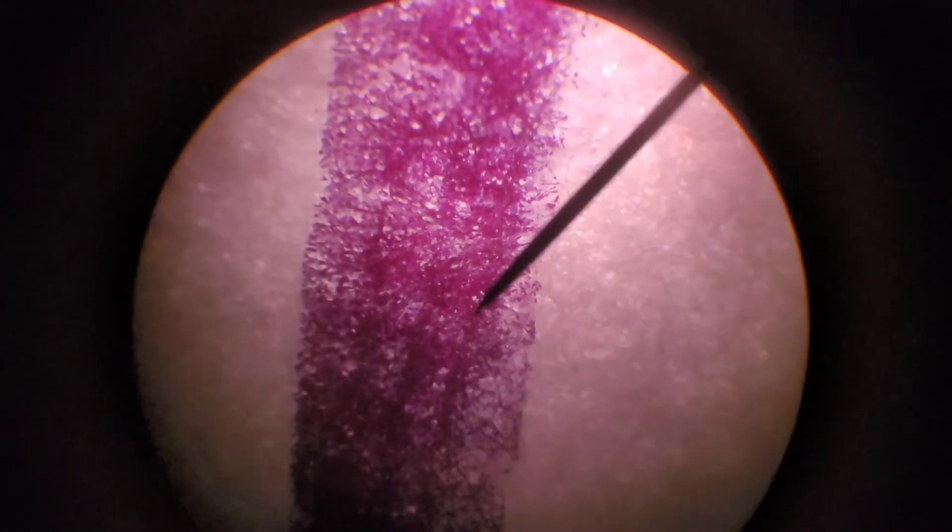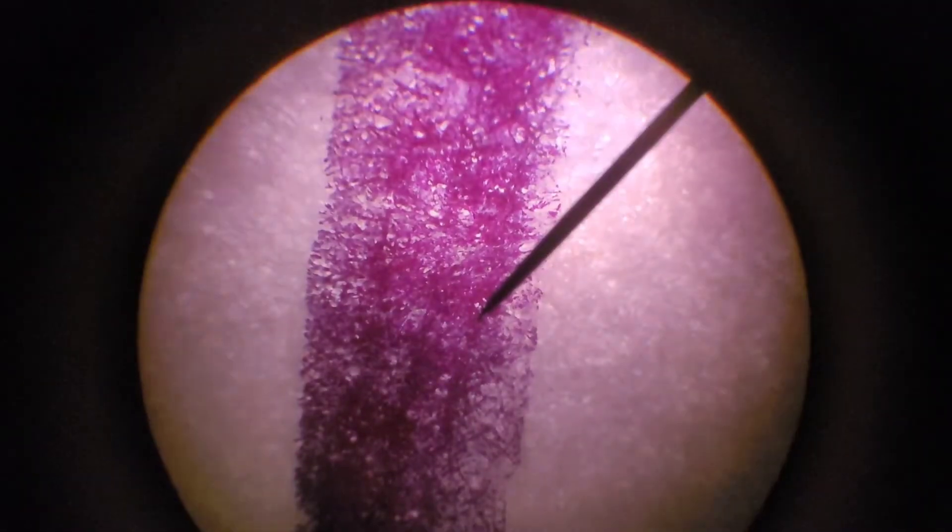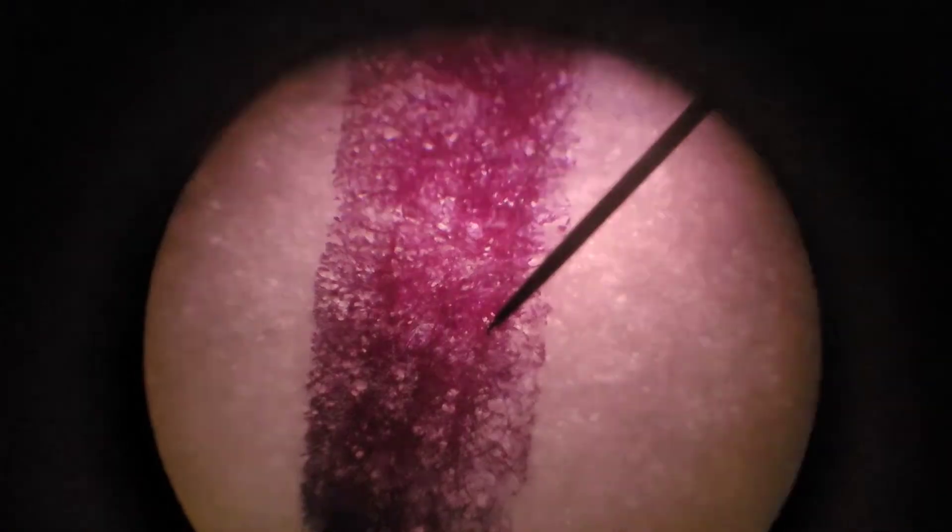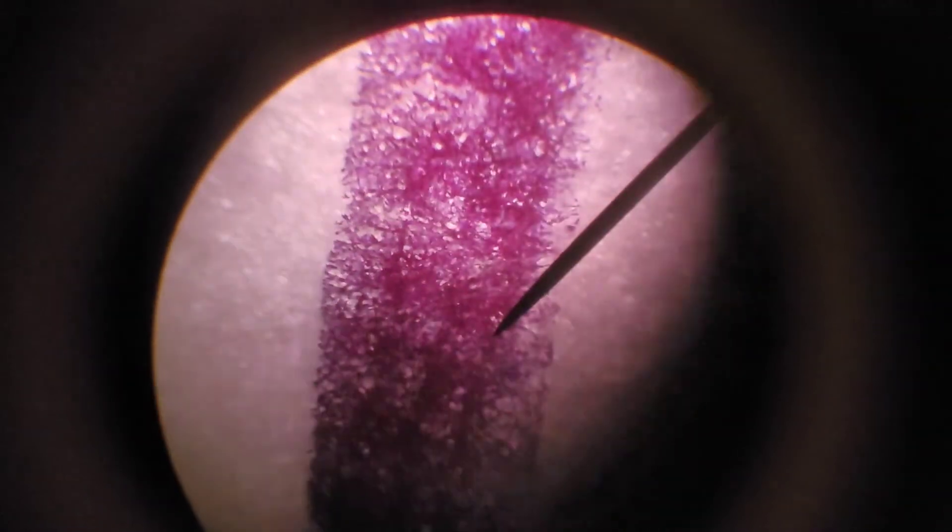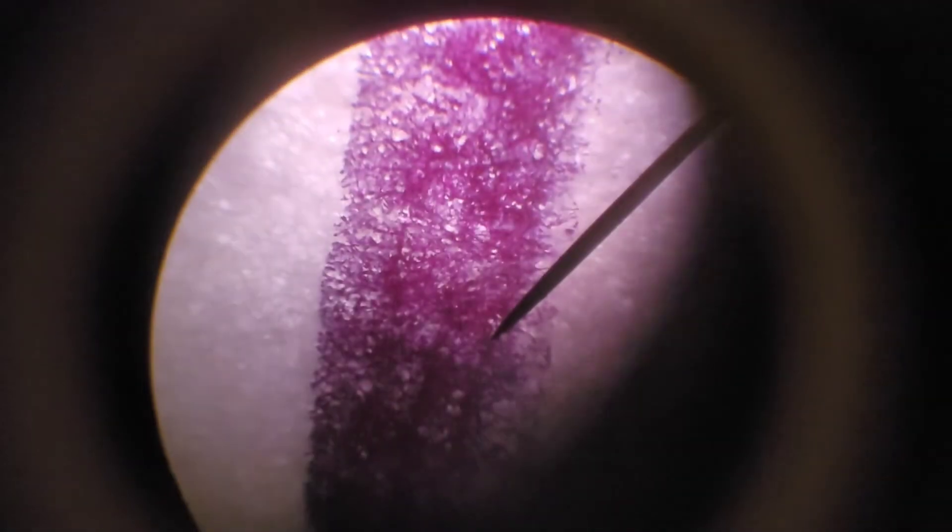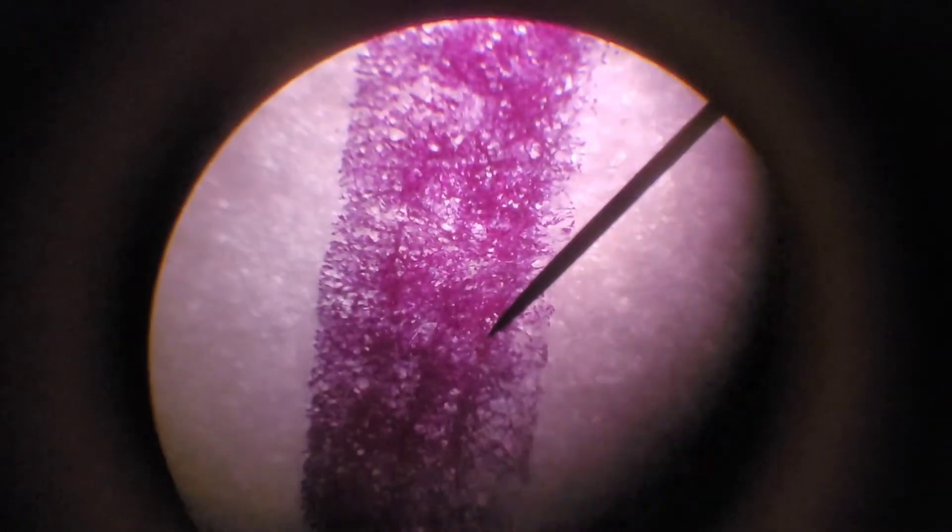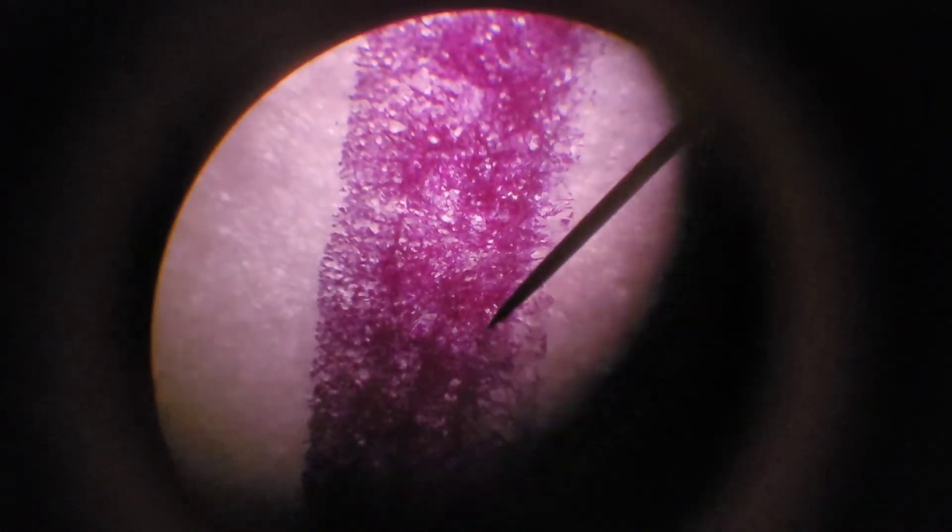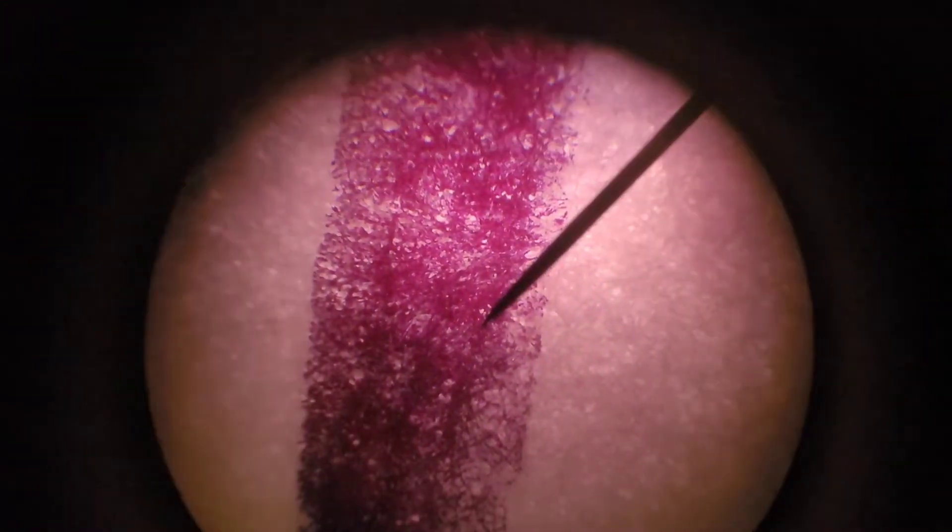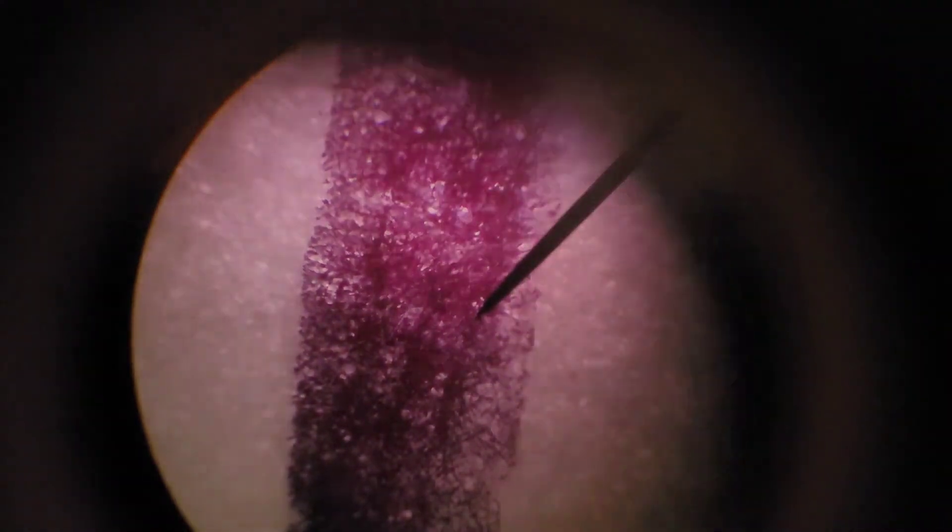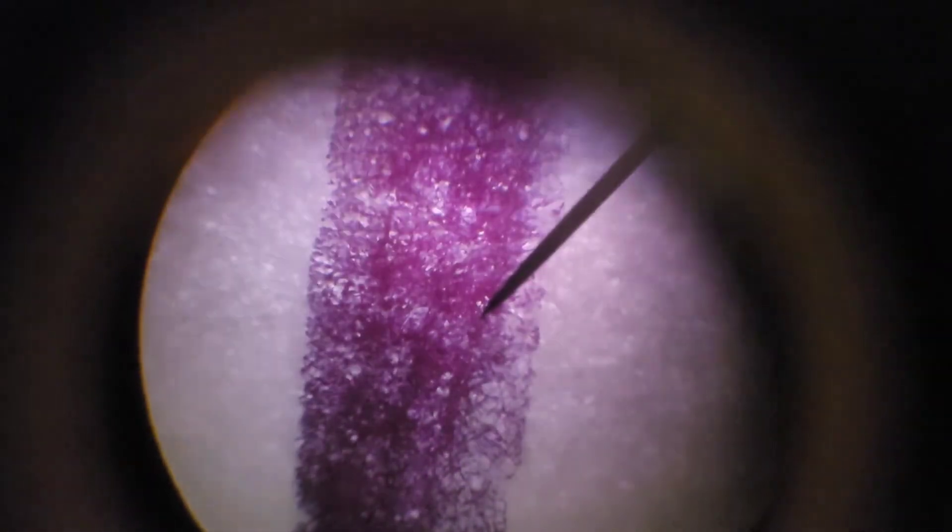So here's what pen looks like under the microscope. Again, not as straight as you'd think it would be. And you can even see all the texture on the paper and ink. It's pretty neat. It's also a black pen, and it almost looks purple here. This might be because I'm using a note card, but it might also be because the ink is slightly dark purple instead of black like I thought it was.